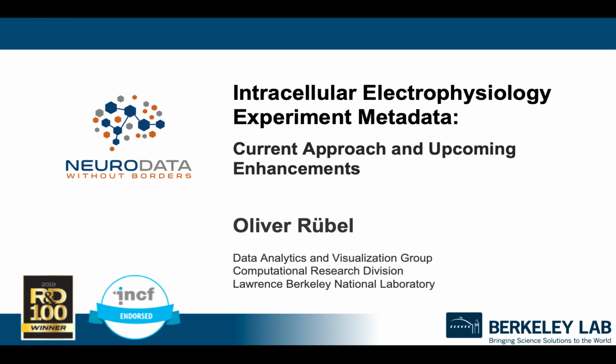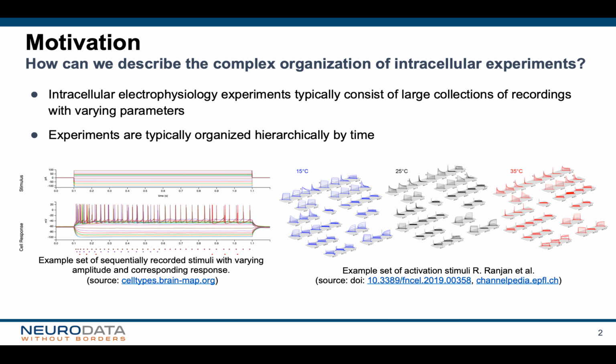Welcome to the second part of the intracellular electrophysiology tutorial. In this part, we will focus on the organization of metadata from these experiments in NWB. Specifically, we will look at the question of how can we describe the complex organization of intracellular experiments.